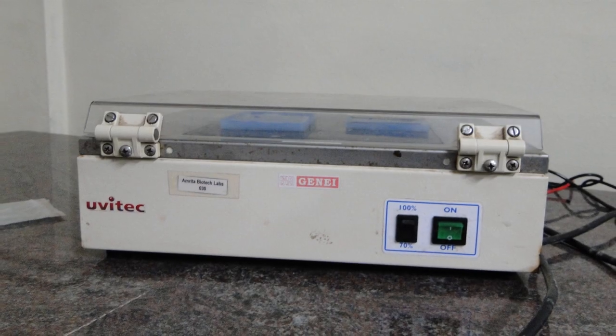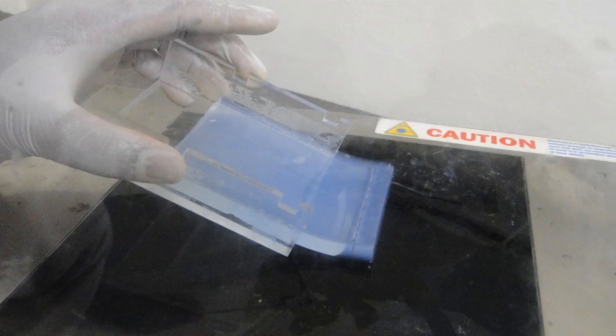Transilluminator, an ultraviolet light box which is used to visualize ethidium bromide stained DNA in gels.